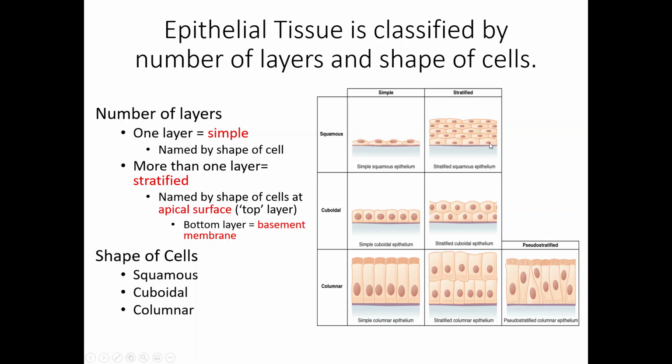Okay. However, if we look at the top, we will see very quickly that no, those aren't cubes. These are those squamous cells, those little flattened cells. So why do the ones at the bottom look different? Well, it's pressure. All of these other layers are pushing down on this bottom layer, and it kind of gives them a different shape for appearance sake.